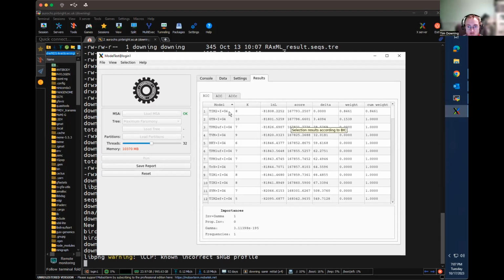So we can then take this forward and look at the tools that we're using and construct a tree using this substitution model, which will then give us a better sense that our phylogeny as constructed uses the best tools that are available for this.